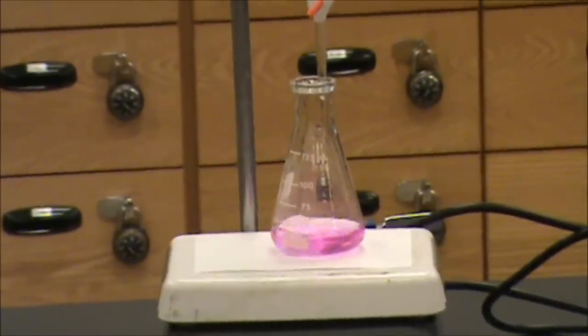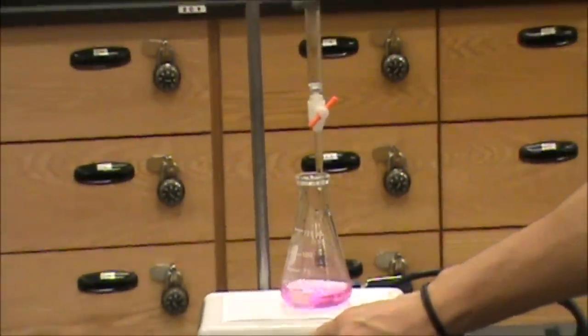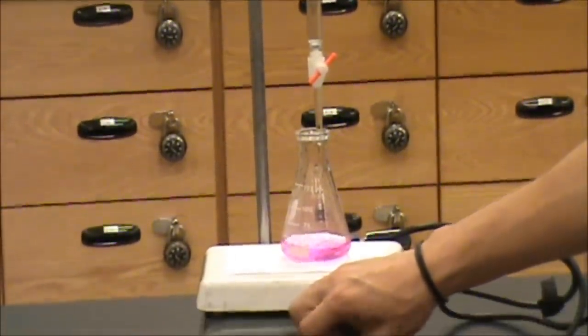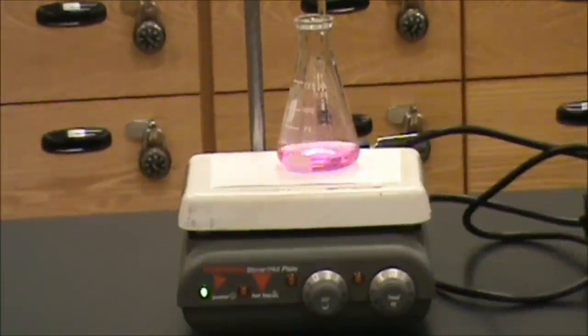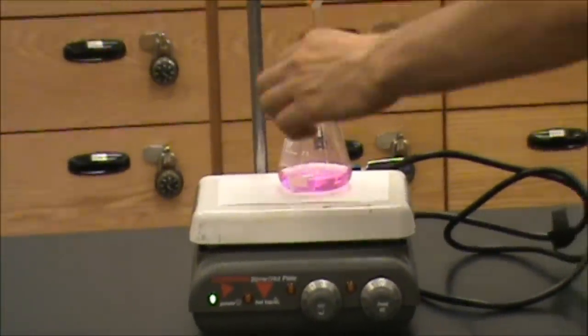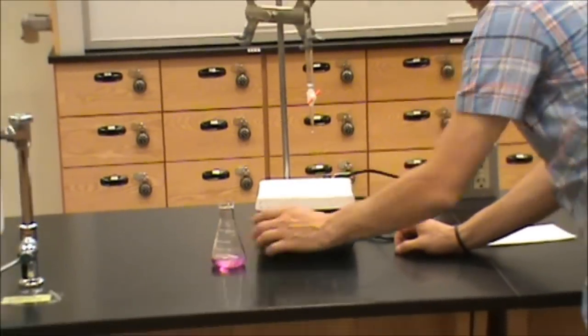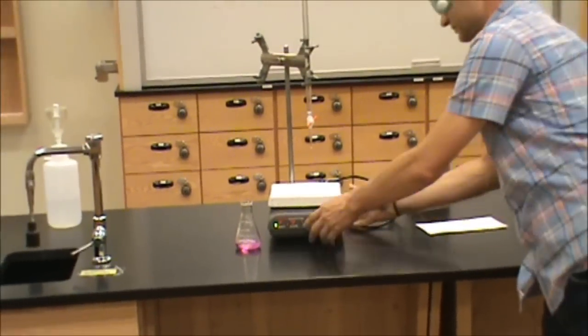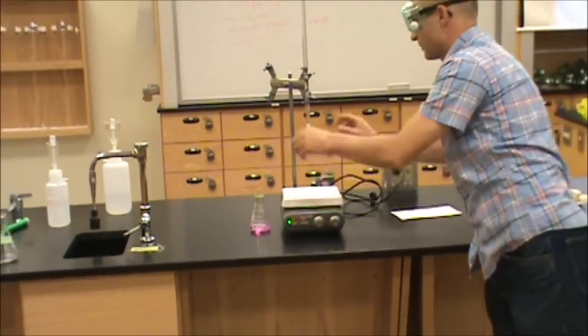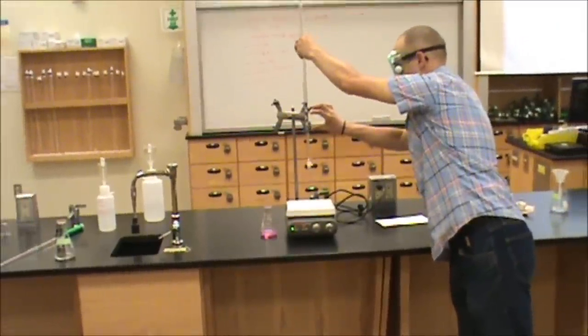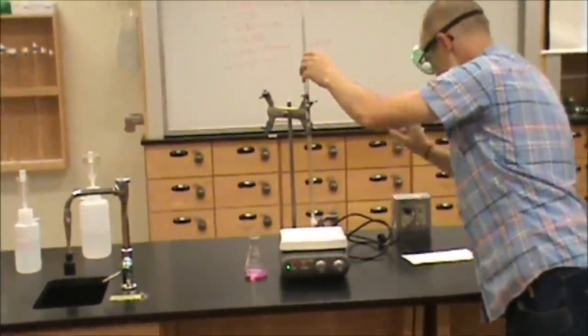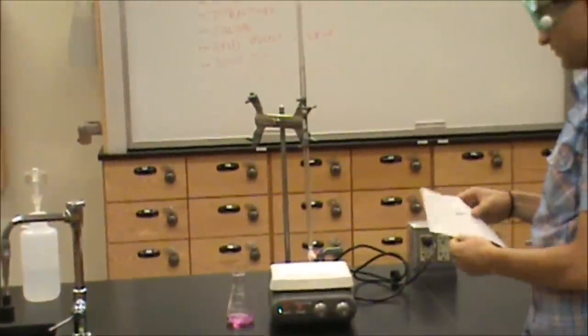And now what we want to do is turn off our stirrer. We are going to remove our analyte, slide our stir plate out of the way, and once again slide our burette downwards so it will be easy to read our volume.